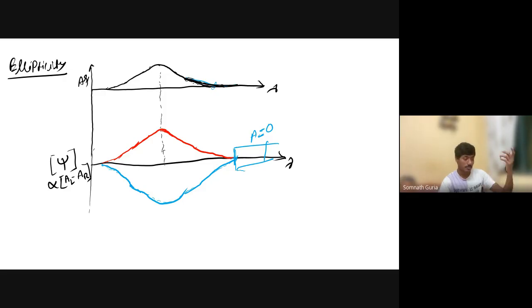So one example is that we have some molecule having a UV-Vis spectrum. This is the last example over here.